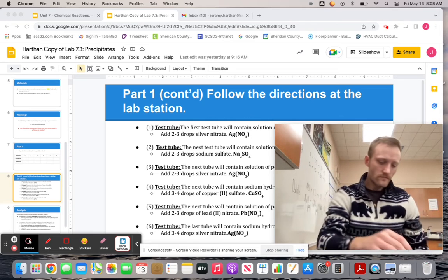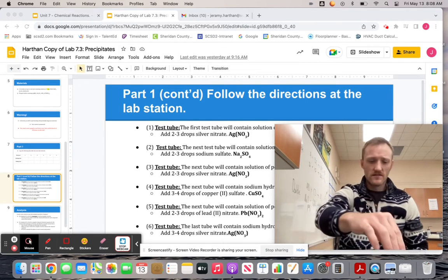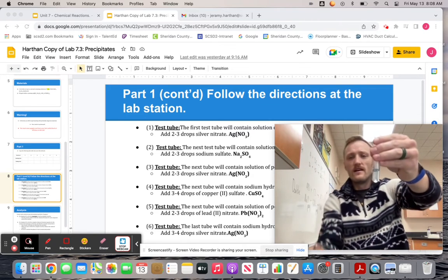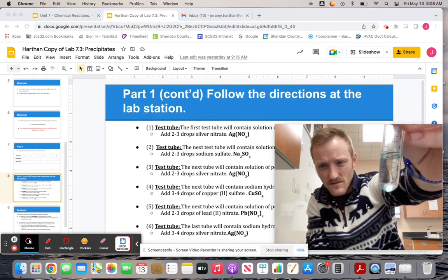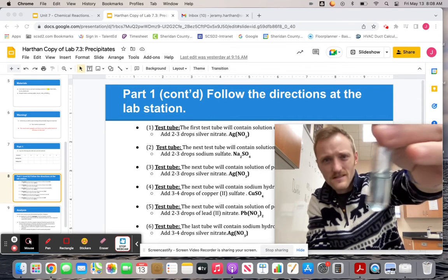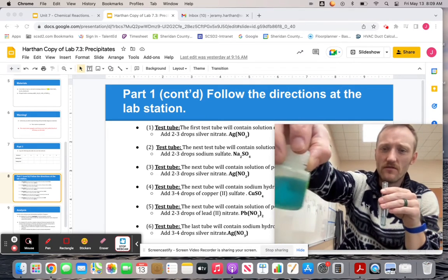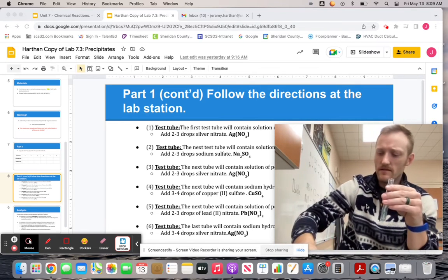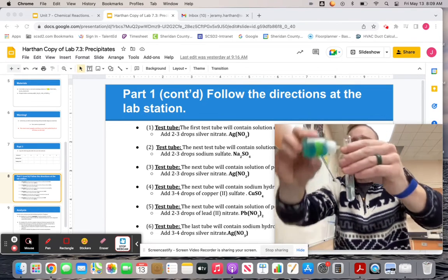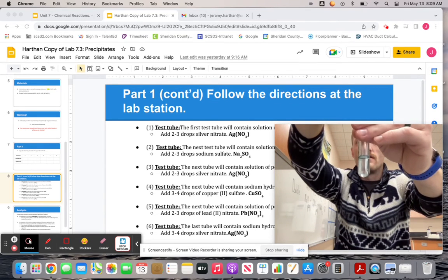Okay, now next one. This is one of my favorites. So, in our test tube, we have sodium hydroxide, or NaOH. So again, got a nice clear, transparent liquid. Our test tube's a little dirty because kids are crusty butts. And then we're going to add some copper sulfate. So you can see this one is definitely still transparent, definitely a blue tinge to it. Okay, so when we add, let's see. Oh, look at that. Right?